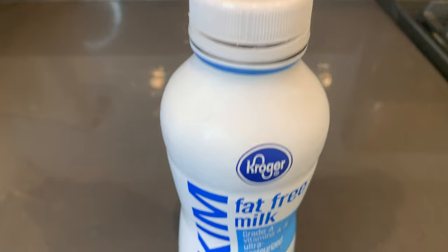How about with skim milk? This was the hardest thing to view under the microscope out of all the milks because I was having a difficult time finding anything. The fat globules stand out in the other milks, giving me something to focus on. But skim milk doesn't have any of that.